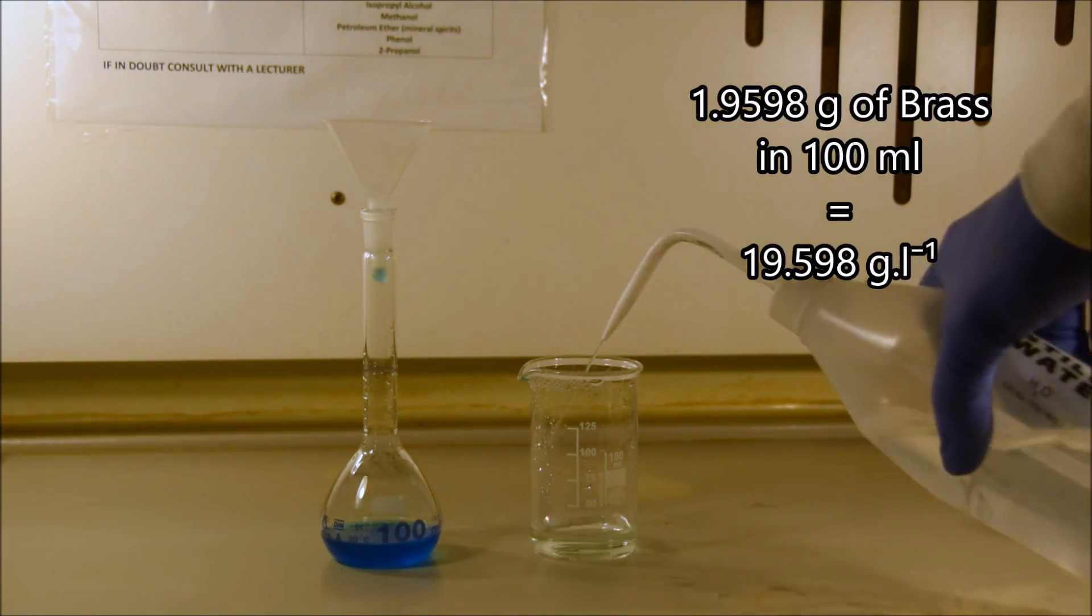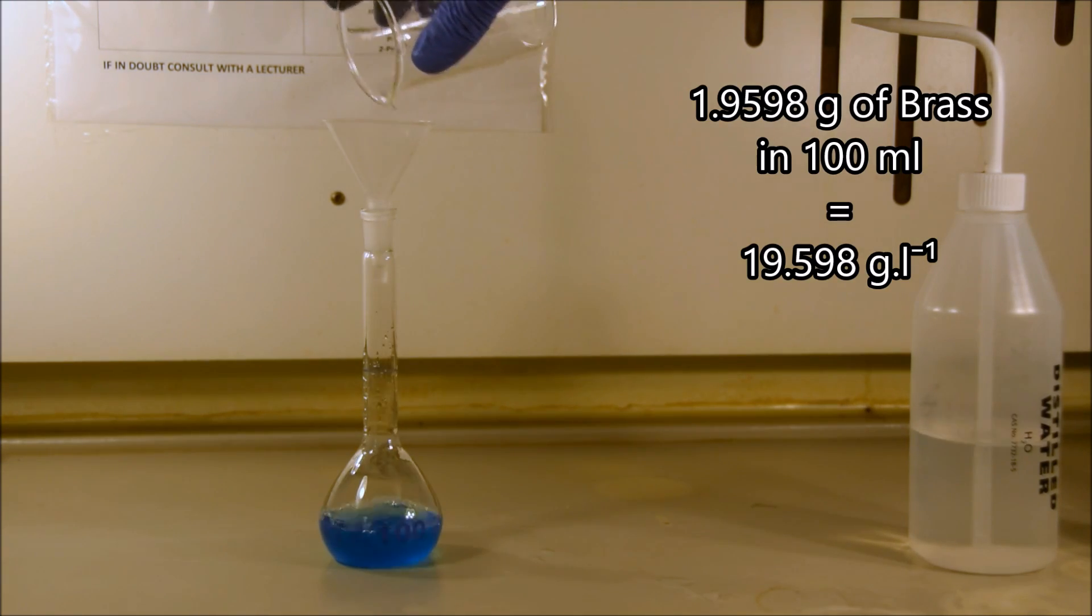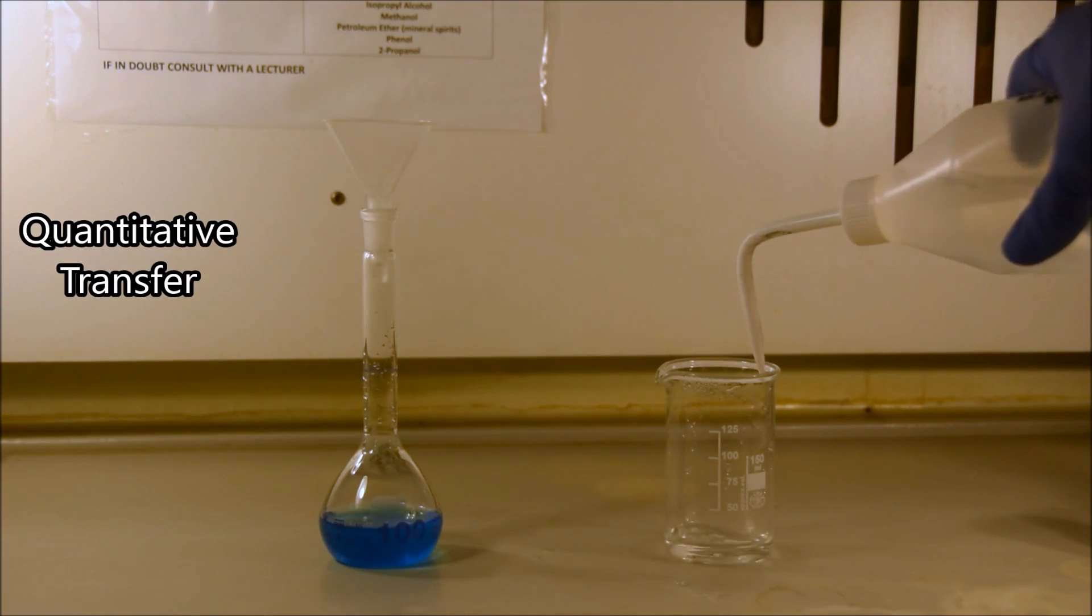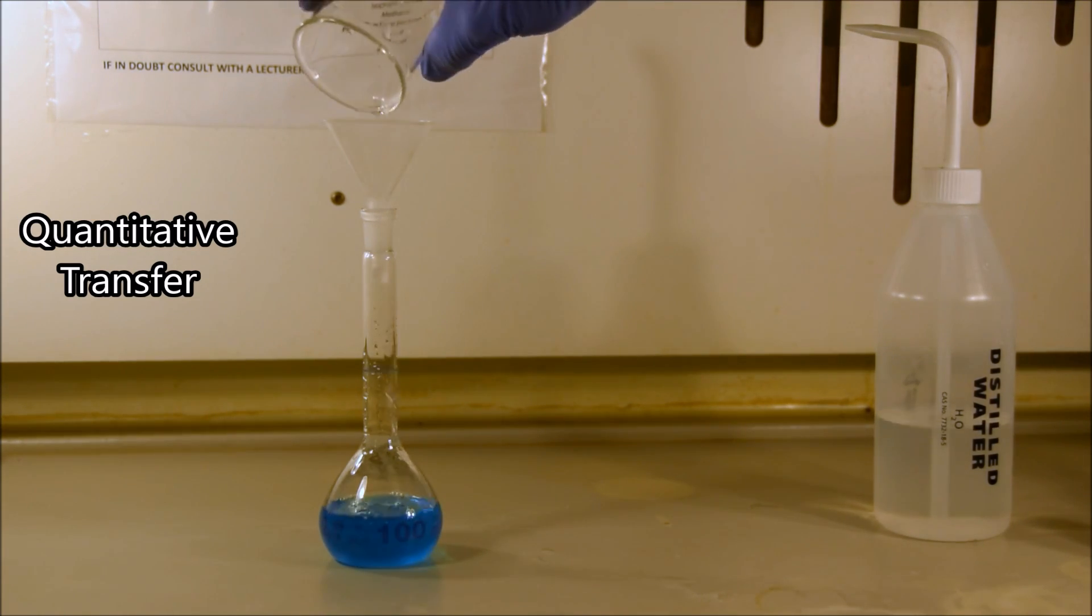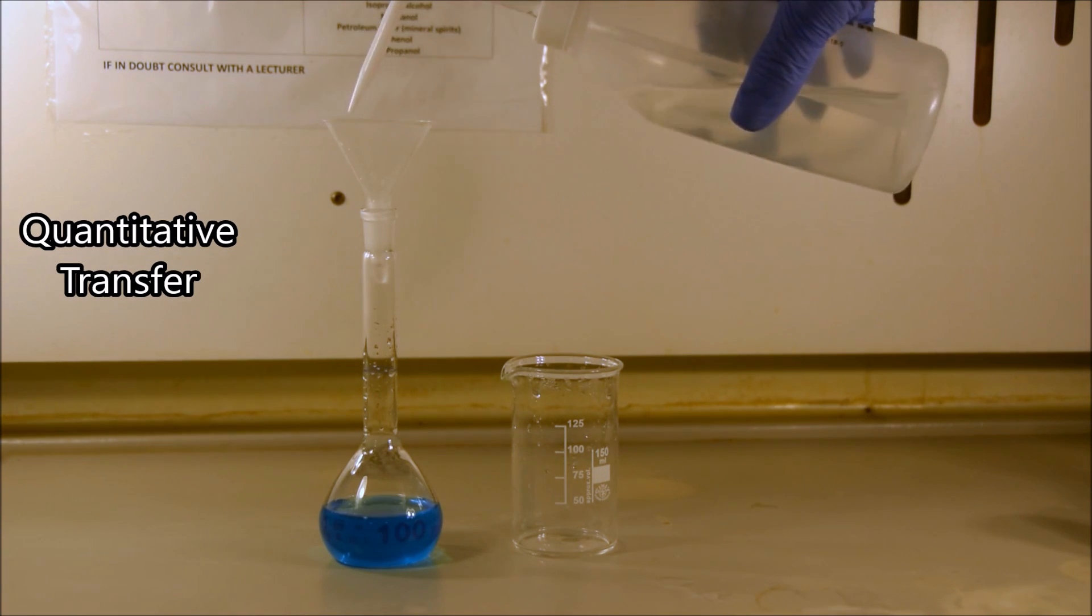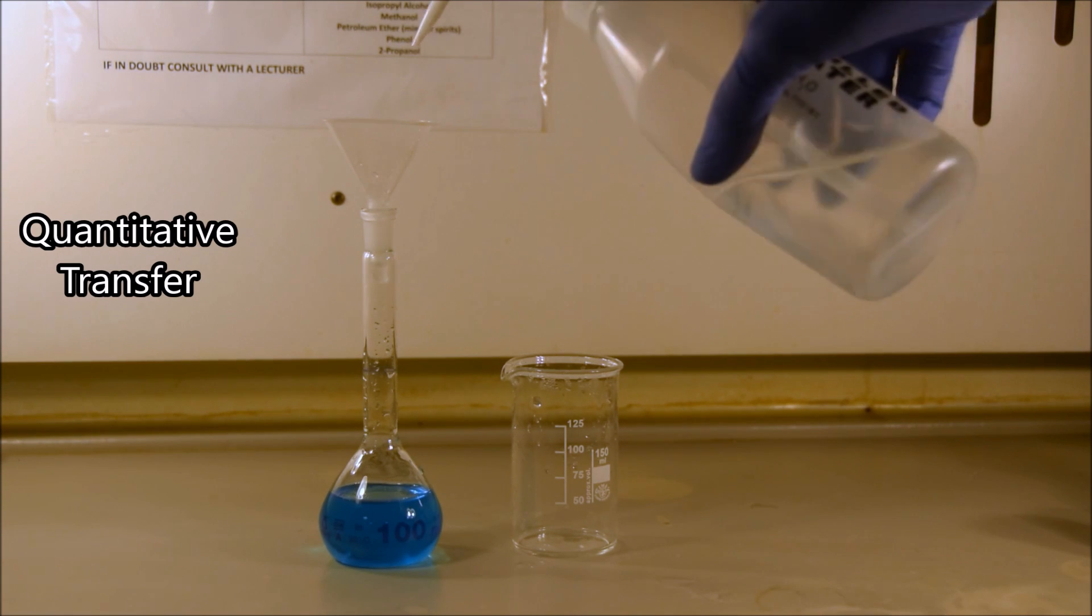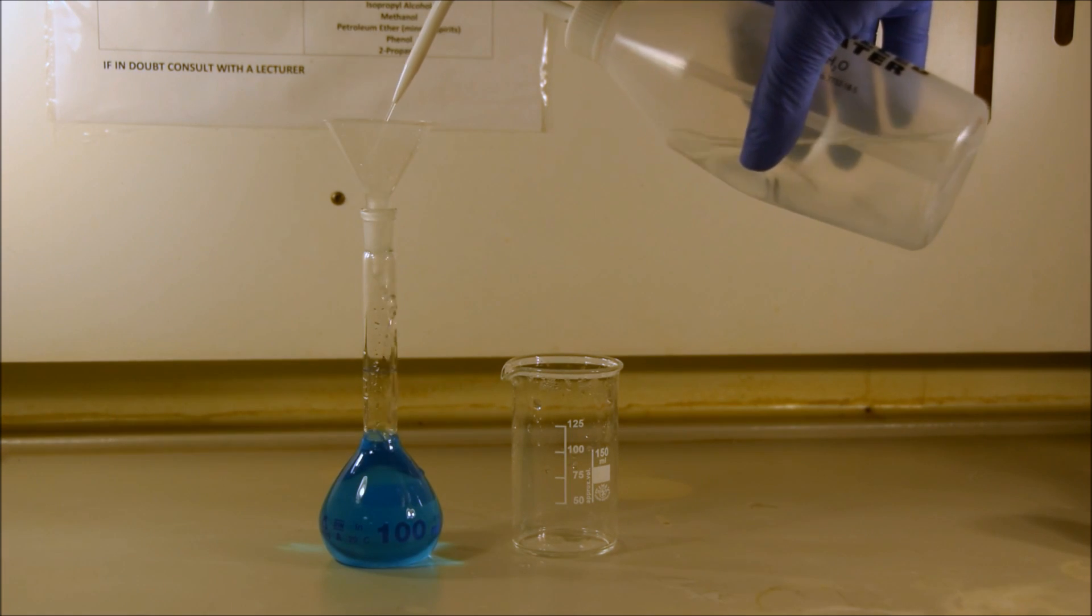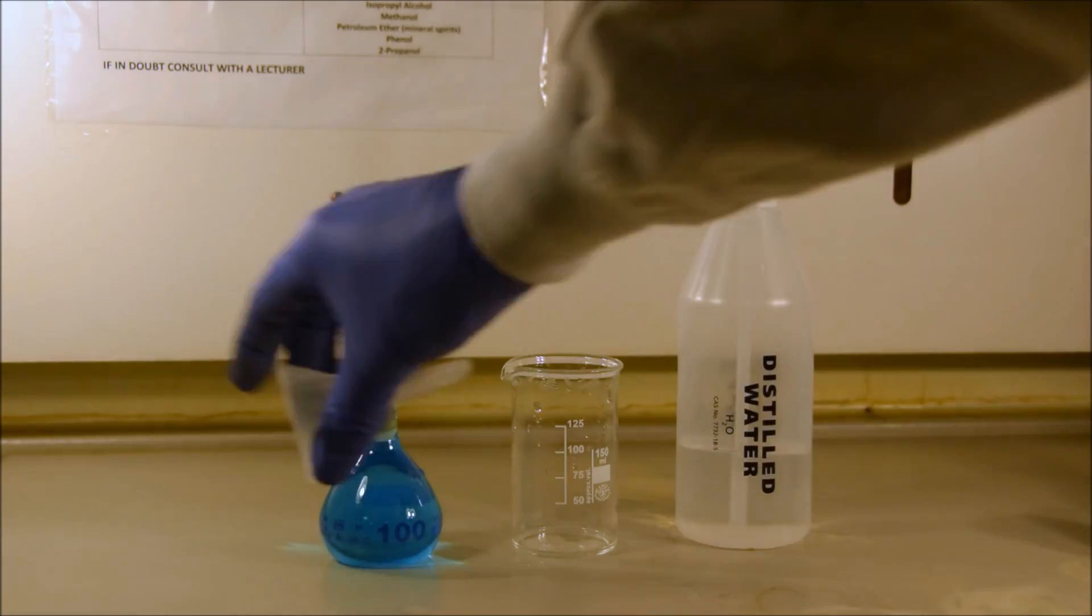For now we're going to look at quantitative transfer. So if we want to do this experiment accurately, it's very important that every little bit of copper, or every little bit of dissolved brass, makes it from the beaker into the volumetric flask. So you can see what I'm doing here, I'm carefully washing down the sides of the beaker, and when I finish washing down the sides of the beaker, I'm going to transfer that into the funnel. Once I've washed down the beaker, and I'm satisfied that there's absolutely no copper inside the beaker, I'm going to wash down the funnel, finish washing down the funnel, and then I can be satisfied that all of the copper has made it out of the beaker, there's none left on the funnel, and it's all inside the volumetric flask.